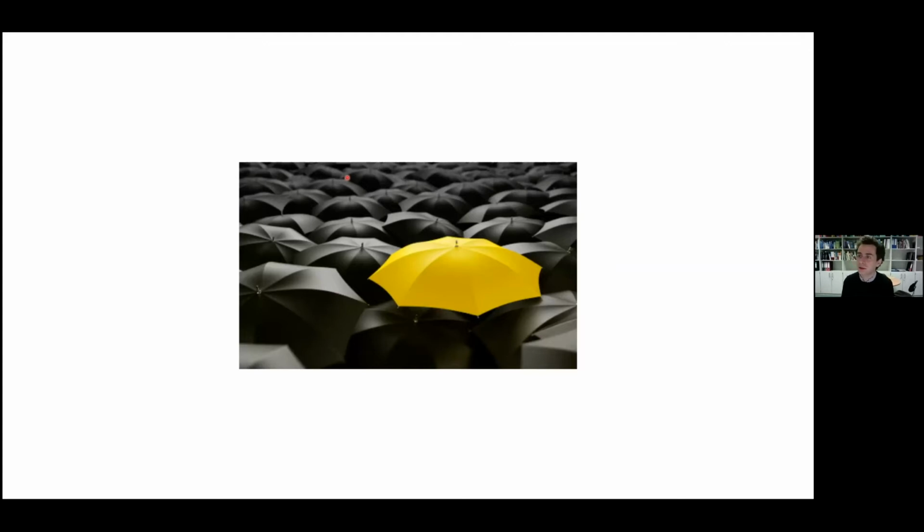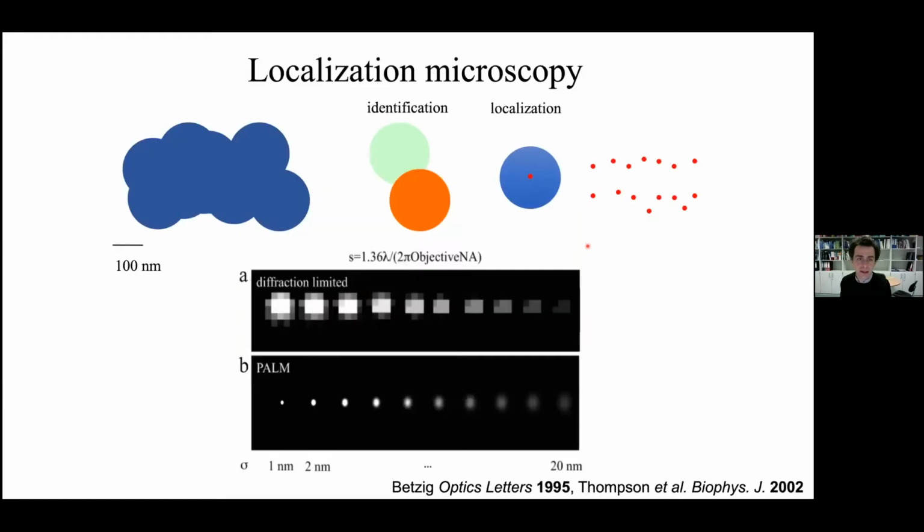But as we said, even if you could do this with molecules, there are only a certain number of colors you can spectrally resolve in a microscope, and you will soon run out of colors. So you could do this maybe for 10 molecules. One way to do this is the notion of molecules being basically distinguishable. So what I want to show you is the example we had before.